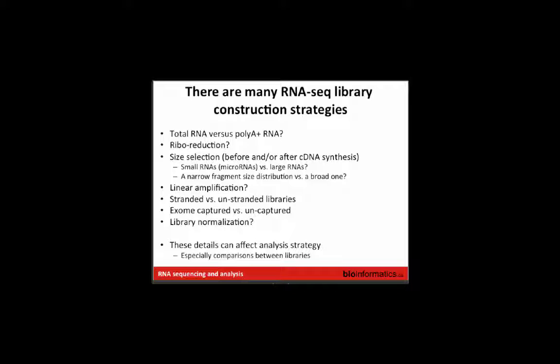Bacterial genomes. The degradation issue that we already talked about. If your RNA is degraded, you don't want to do poly-A selection because it'll introduce 3' bias. But generally, the philosophy is just that it's a more complete view of the transcriptome.